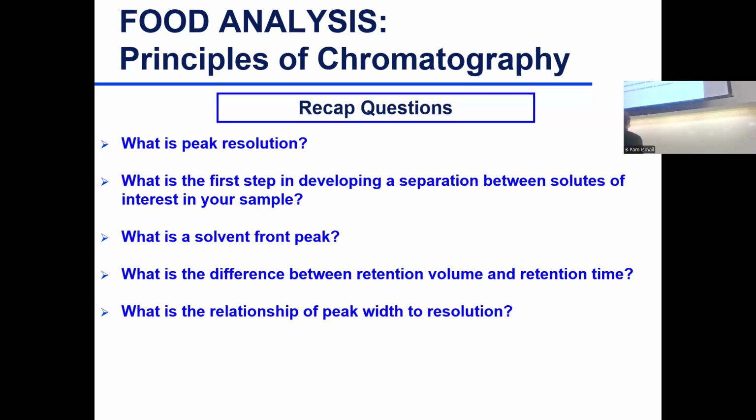And often, or all the time, you're going to see me draw this very often. So you'll have this is your solvent front. It depends if it's a GC. Sometimes it's much bigger than this. In HPLC it's tiny. And then you have your compound coming off the column. And this here is time. And this here, what? I drew this before. What's the y-axis? Signal strength. Yes. So area under the peak we calculated here.